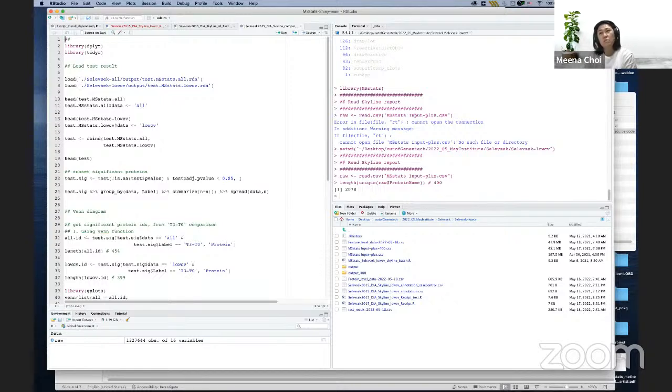In global protein profiling, we just quantify all the proteins in the samples. But the IP case is quite different, right? We have a bead and we grab whatever interacts. First of all, the total quantity of protein is different, and their levels are also really different.